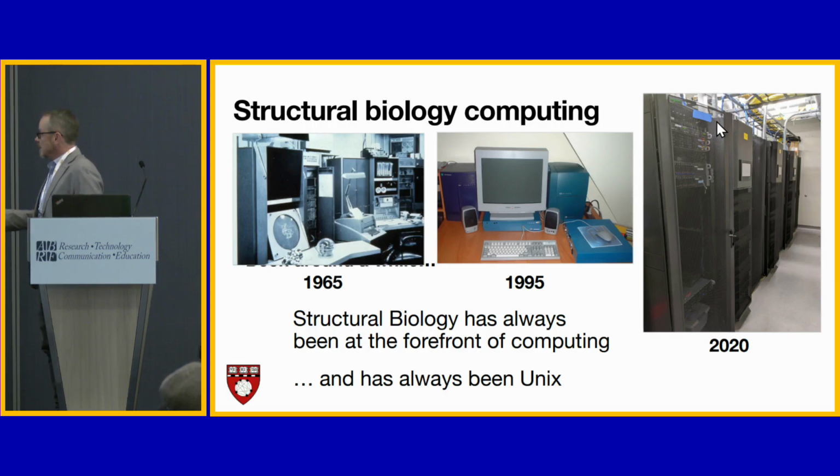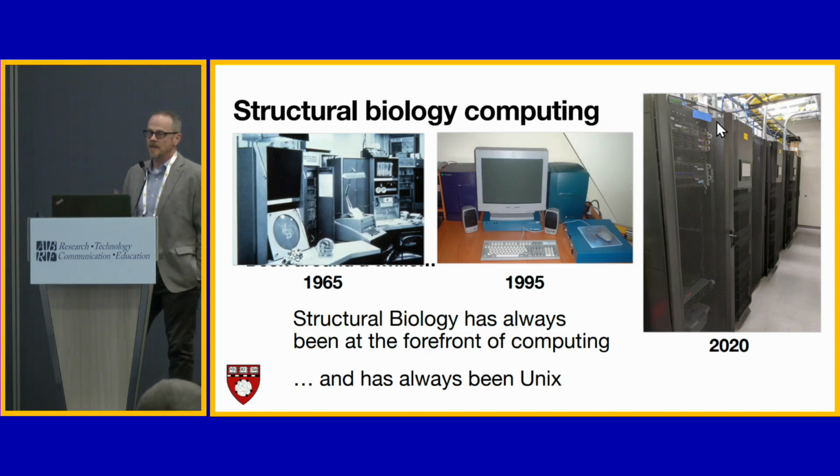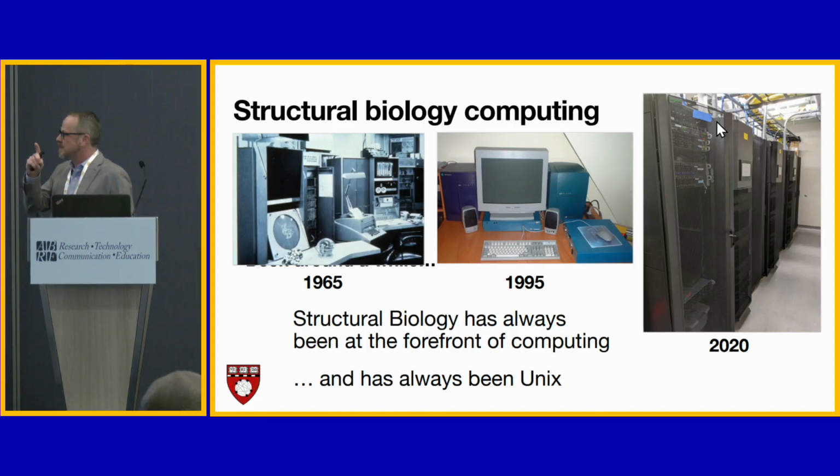And so this is what our modern workstation, I guess, looks like today. This is our SBGrid data center. We currently have petabytes of storage. I think we counted up 400 GPUs. We had 401 last I checked, so we went over the 400 mark. So the computing just keeps going further and further, and we're just trying to keep up now, mostly with cryo-EM.